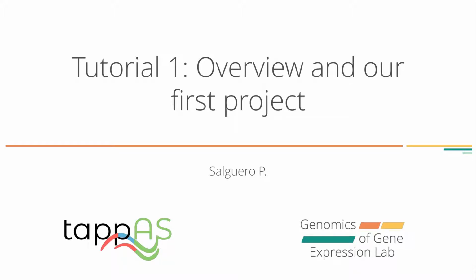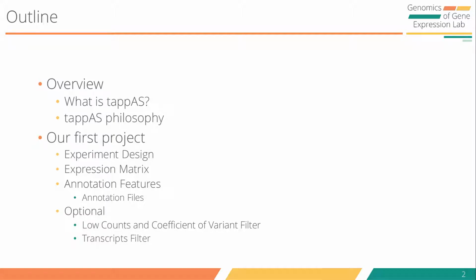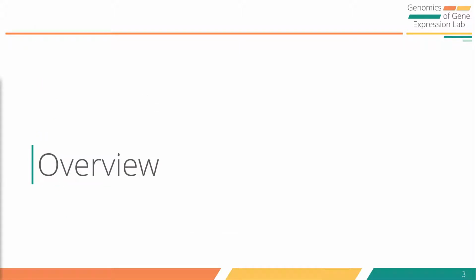Video Tutorial 1, Overview and our first project. In this video we will describe the main objective of tappAS and how to create our first project with the correct input data. So, what is tappAS?